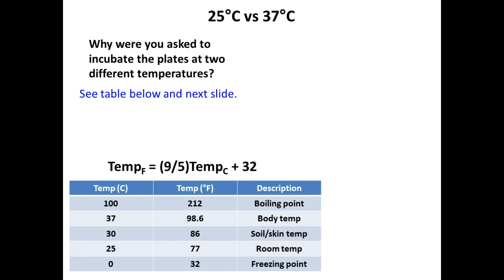So we work with a few microorganisms that don't like it quite so warm as 37, but need some warmth to grow effectively. Mostly they're what would be soil contaminants that we utilize, but it would also be similar to skin temperature, something that would grow on our skin.